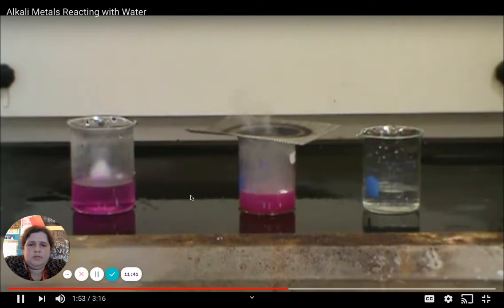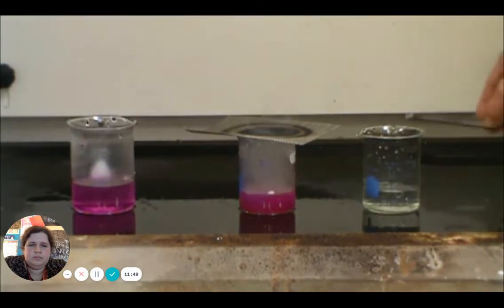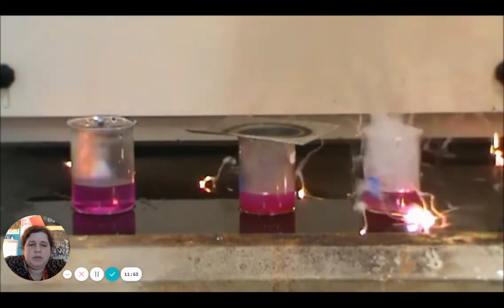So this is less potassium than the other two in terms of amount. You'll find that the reactivity is a little bit greater. So the potassium reacts quite a bit.